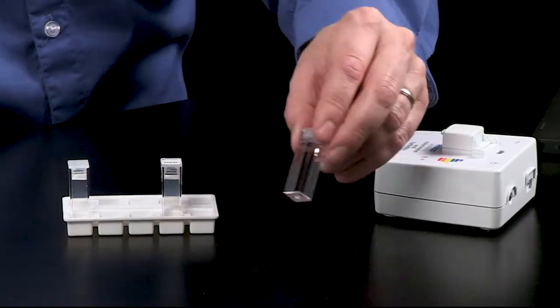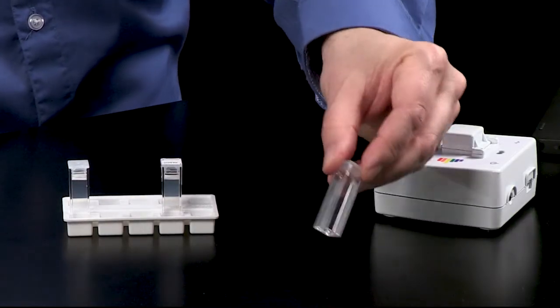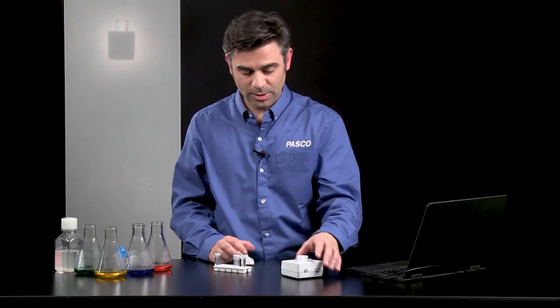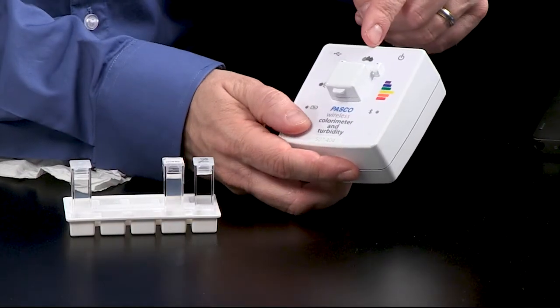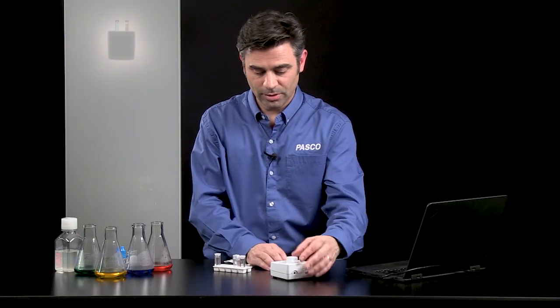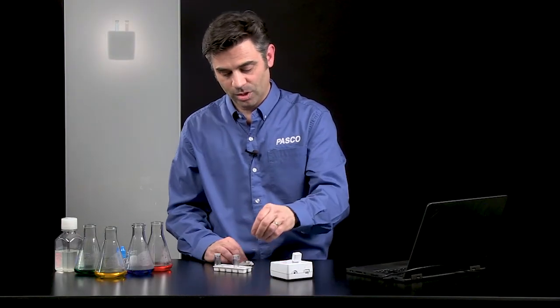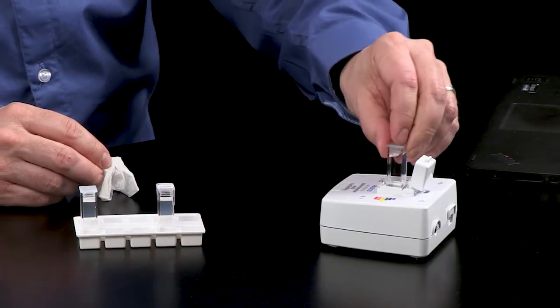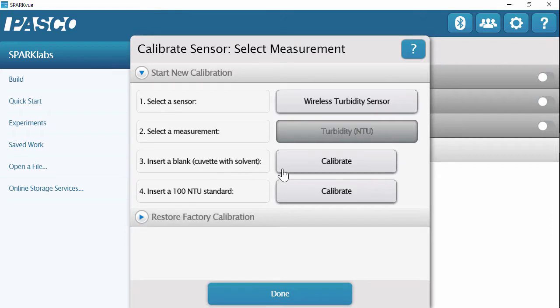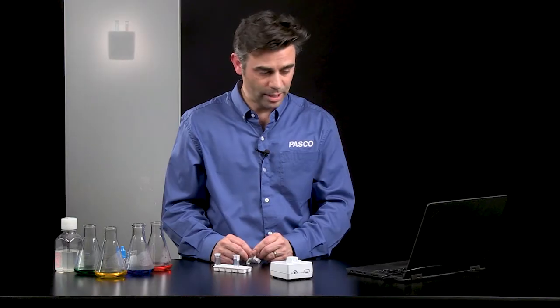So if you notice when I'm doing turbidity, you want to make sure you're using the four-sided clear cuvettes. And that is because the turbidity measurements, the light is coming perpendicular to the detector. So I'm going to use this four-sided clear cuvette. I'm going to put in my blank or my 0 NTU standard. I'm going to calibrate. I get that check. So I know that the calibration is complete.